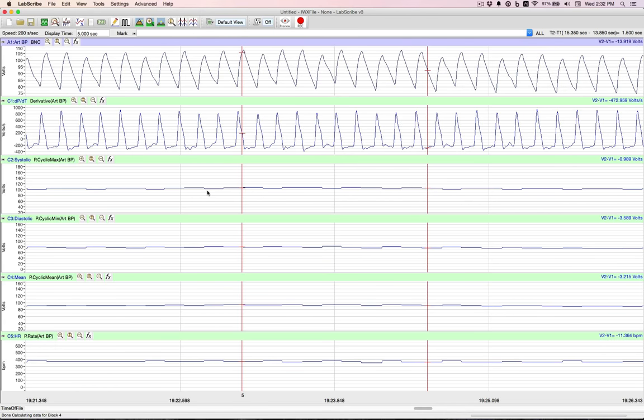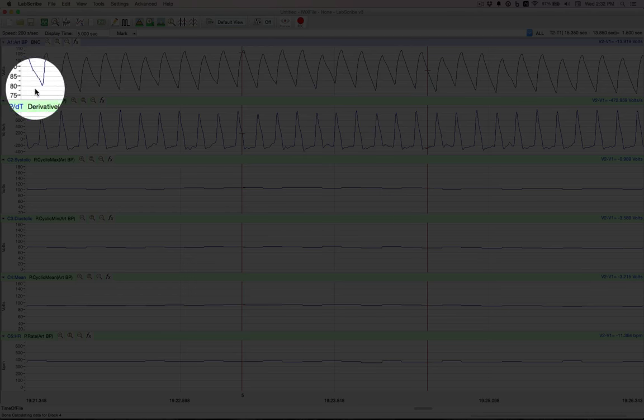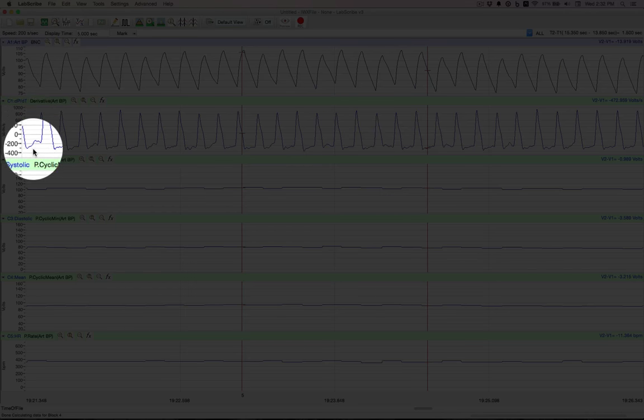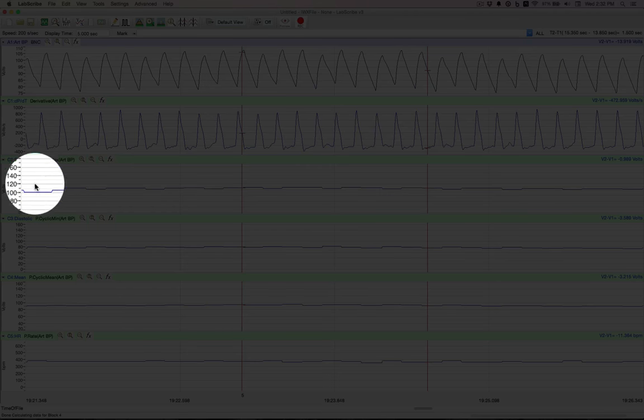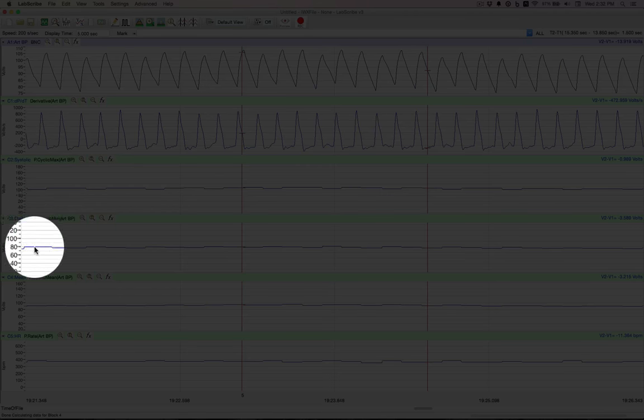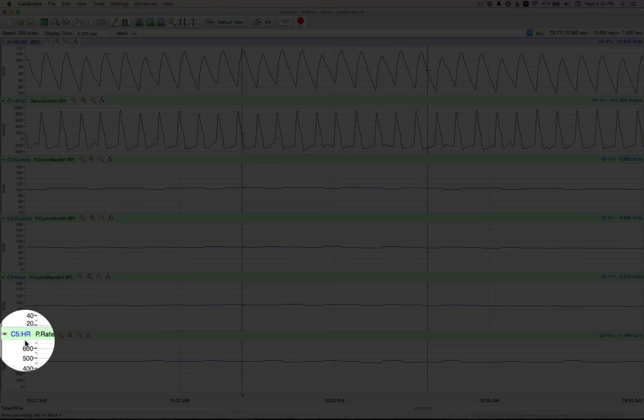Here we have a pressure trace. We have the arterial blood pressure on channel 1, and we've calculated DPDT on channel 2, systolic on channel 3, diastolic on channel 4, mean on channel 5, and the heart rate on channel 6.